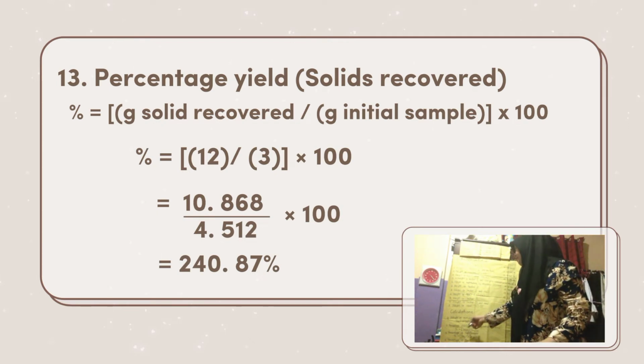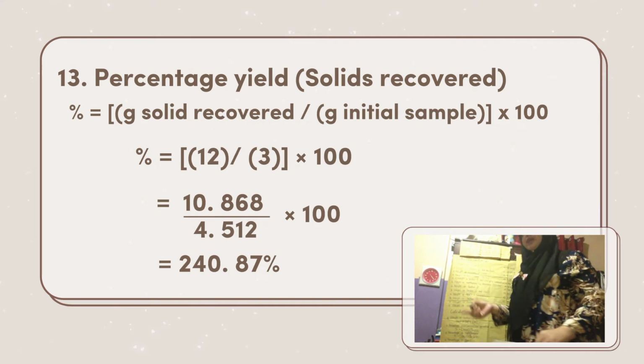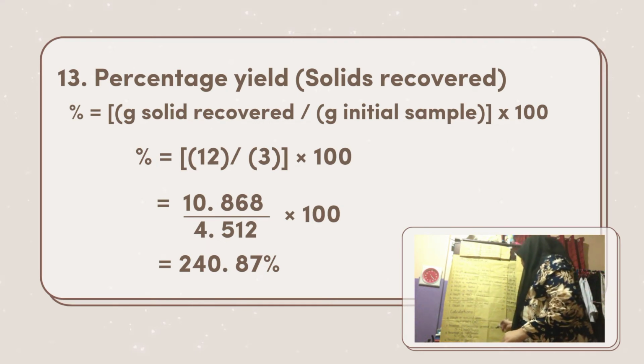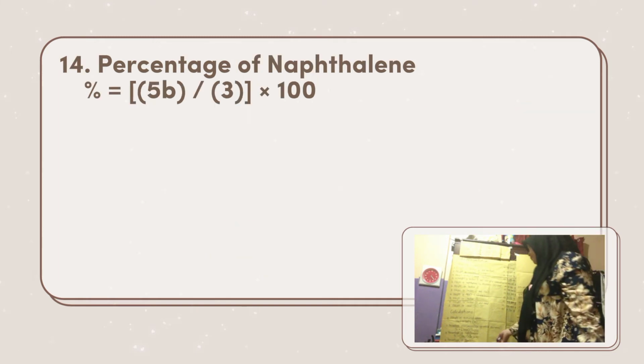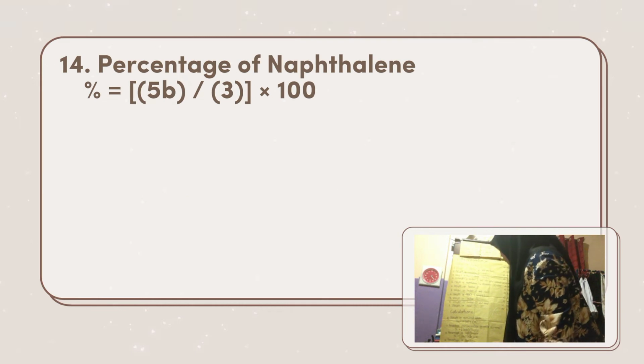So we have a percentage yield, or percentage of solid recovered, of 240.87%.